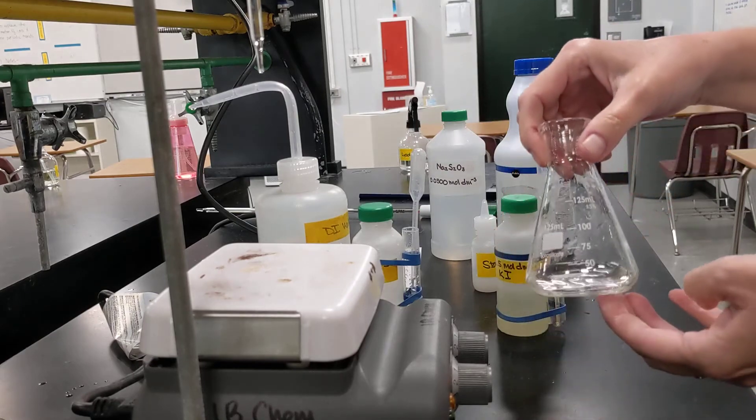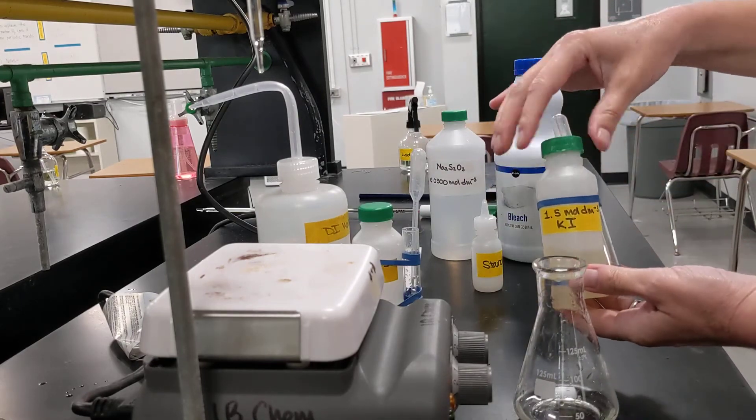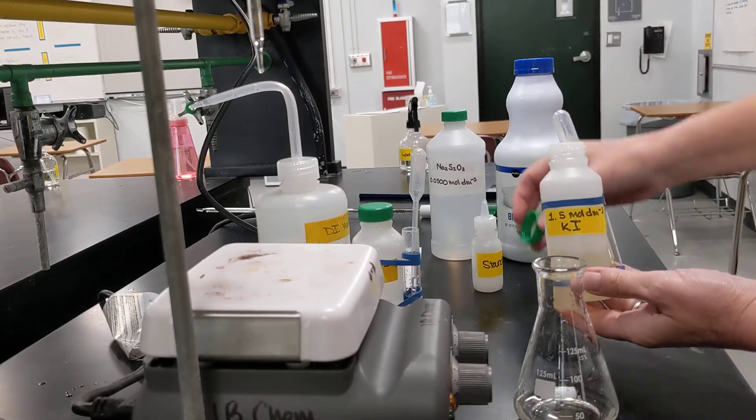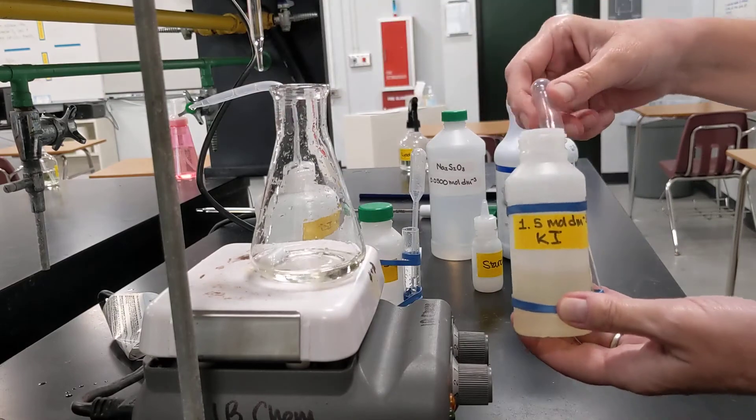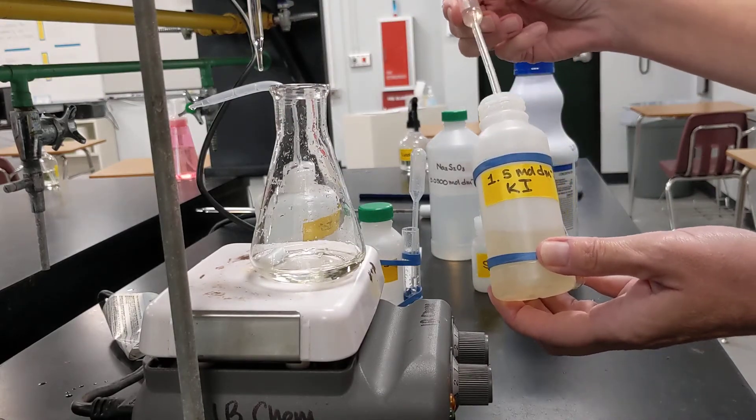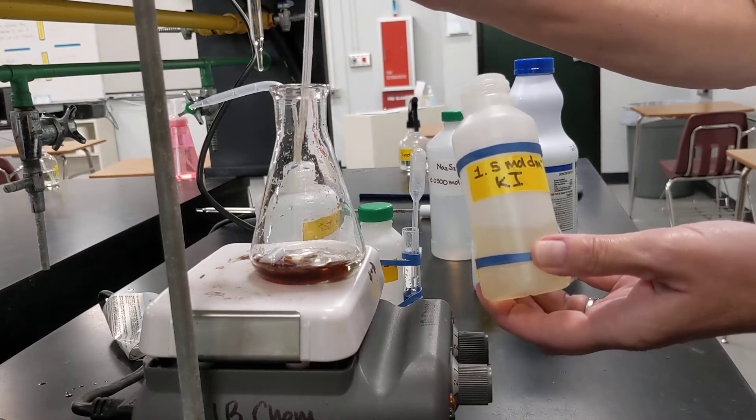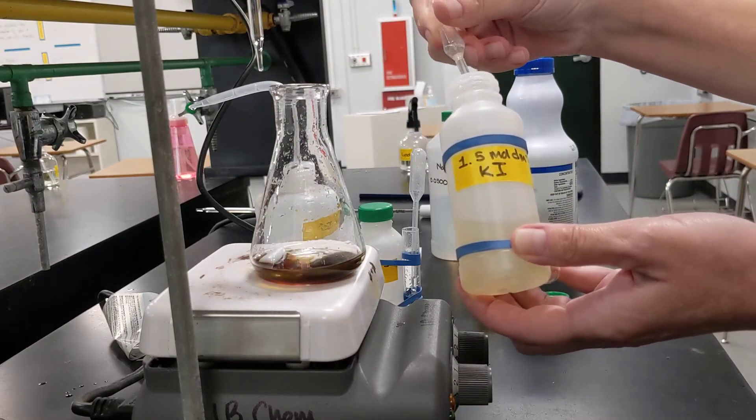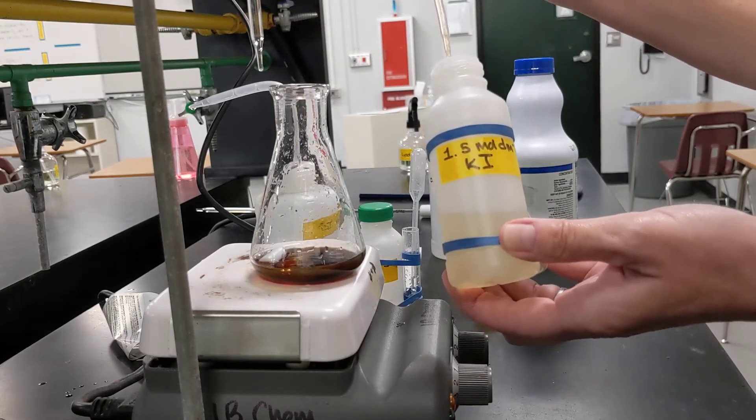And then the next thing I'll add is some 1.5 molar KI. And when I add this, let me put it up here, we will see the difference between a redox titration and an acid-base titration. The minute I add, the second I add that KI, we see a drastic color change.